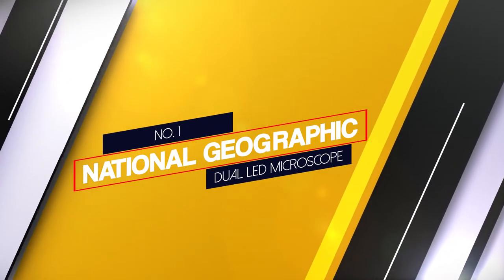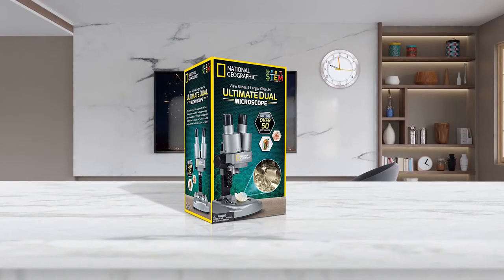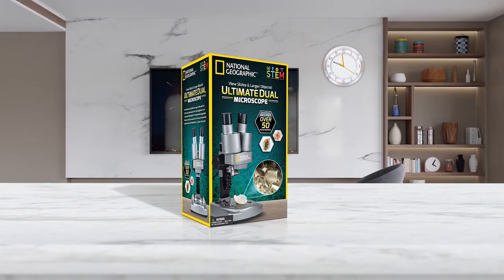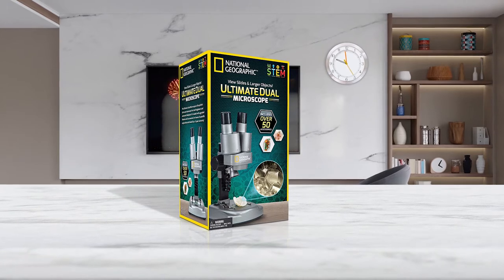Number 1 — Most Popular: National Geographic Dual LED Microscope. This microscope provides two LED lights. One can use the lower light to view the object inside, or activate the upper light to observe 3D objects in more detail.